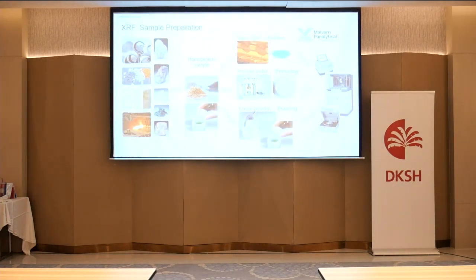Okay, so that was about the XRF part, but an important aspect of XRF is also the sample preparation. You can have many different kinds of samples, but if you want good results, you can directly analyze the solid, but the analysis would be more semi-quantitative. If you want very accurate analysis, then you have to crush it into a fine powder, unless it is a liquid, in which case you can directly analyze the liquid.